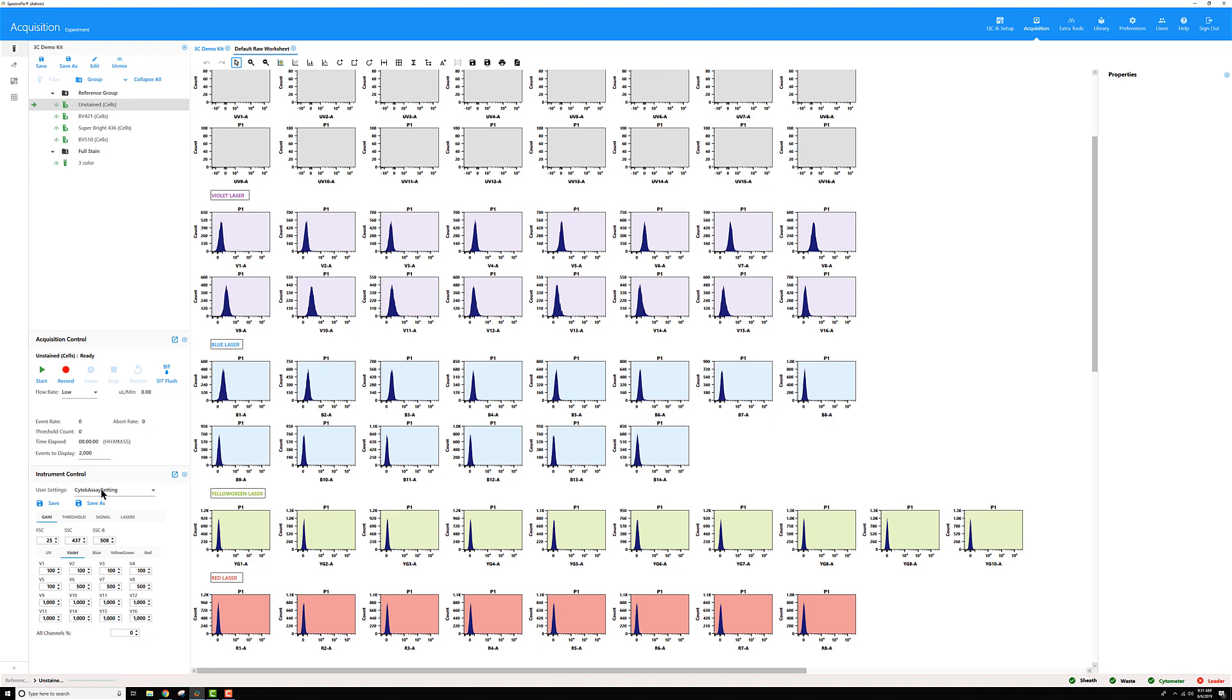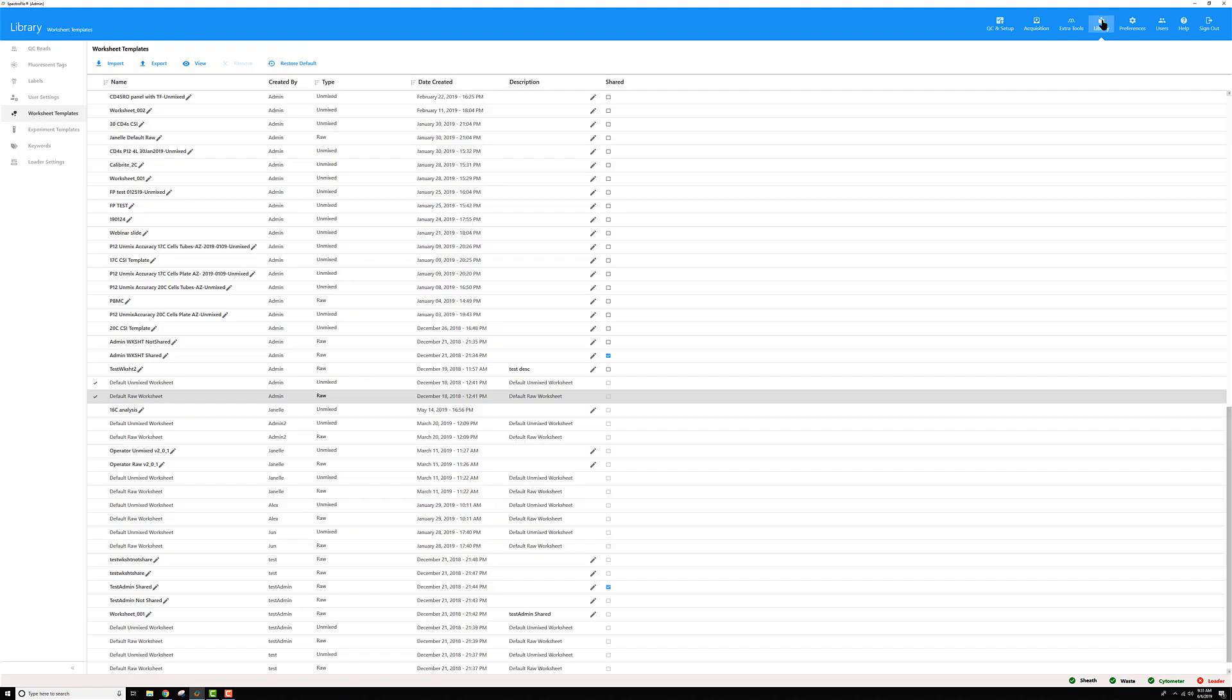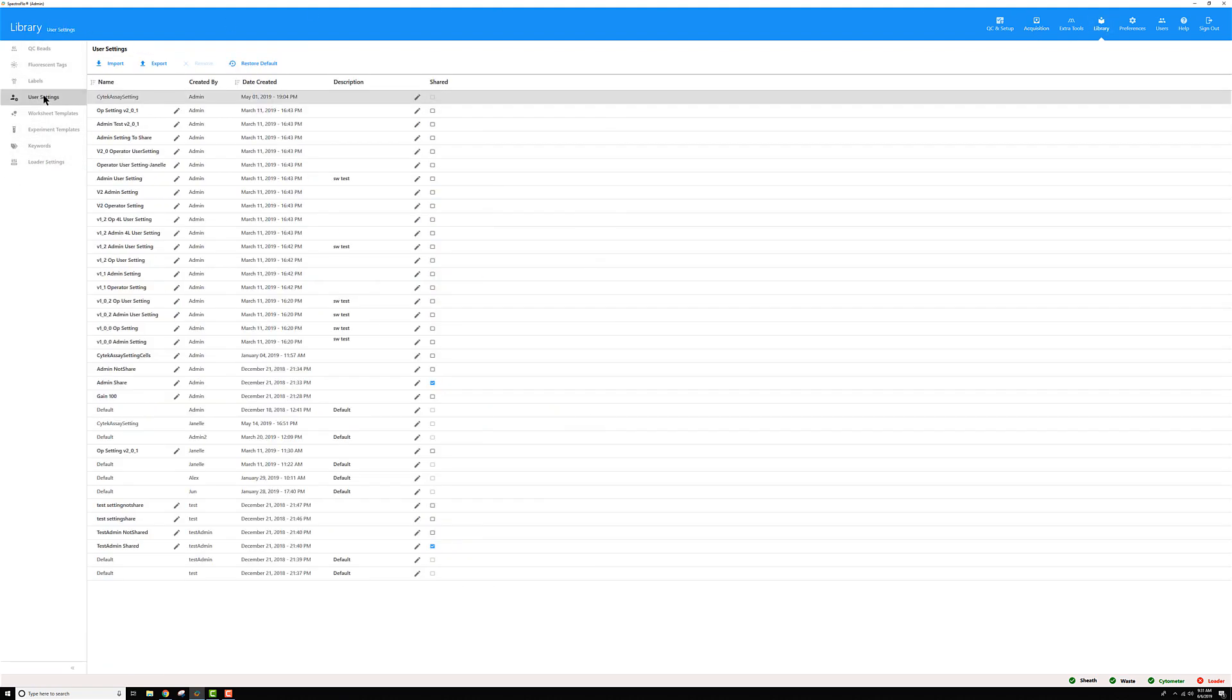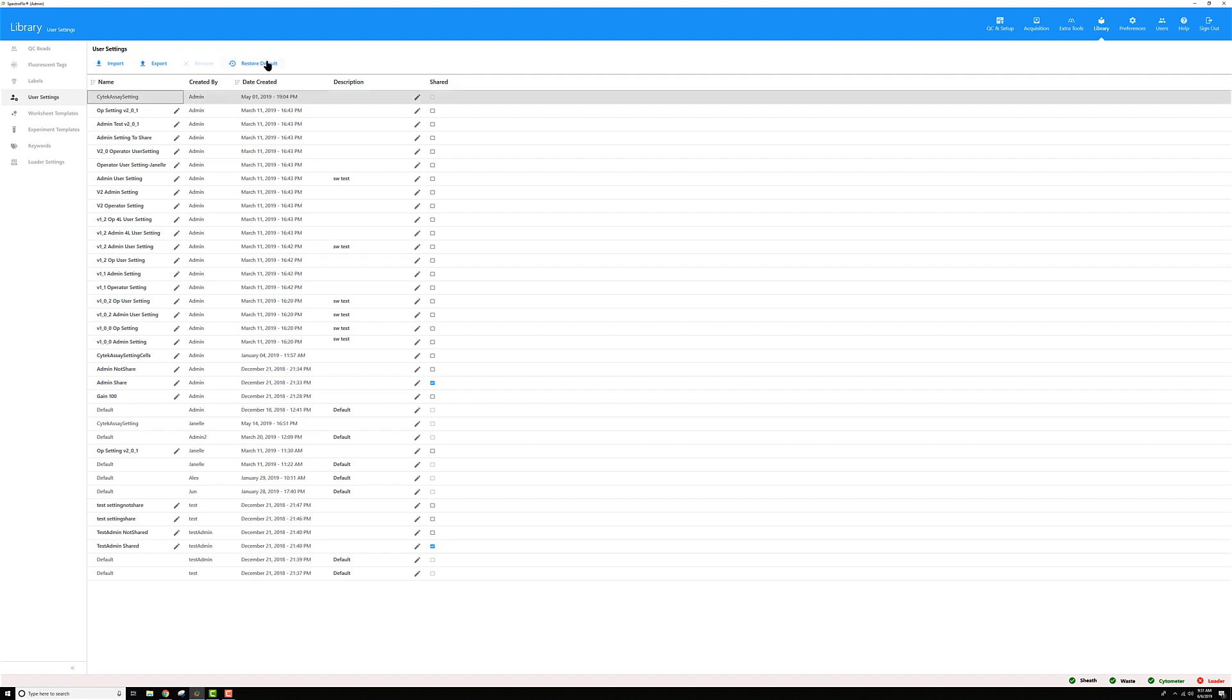So to do that again you go back to that library module and this time go to the user settings tab. Then in the user settings find that setting, so here it is Cytek assay setting made by admin which is the account I'm logged in as right now, and click restore default.